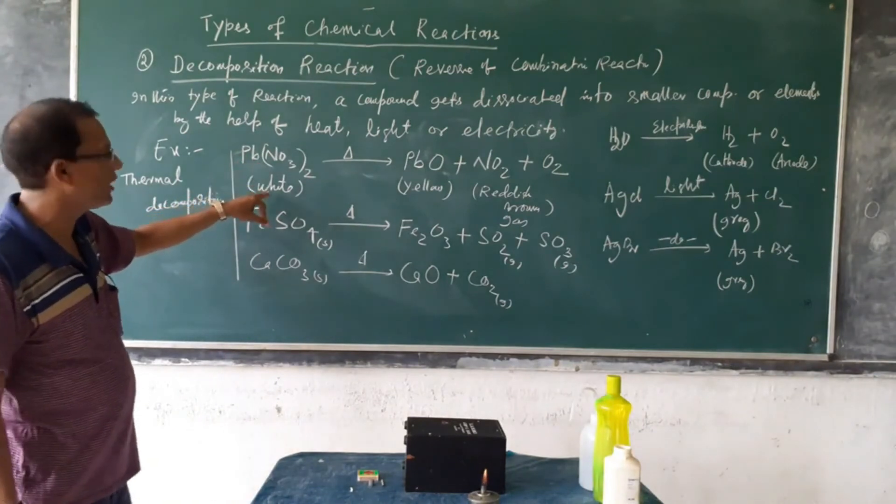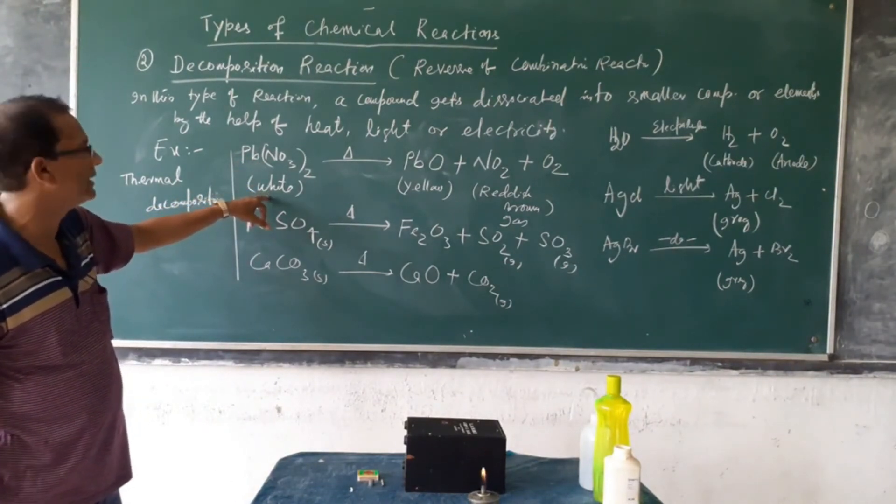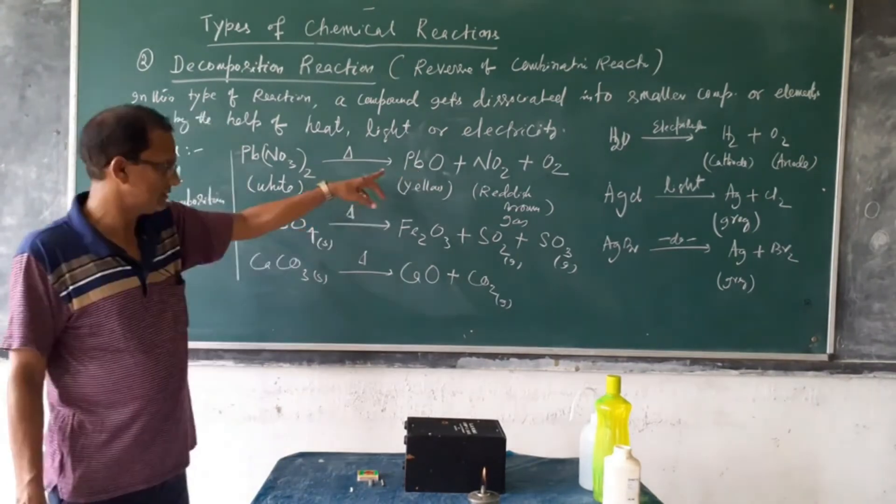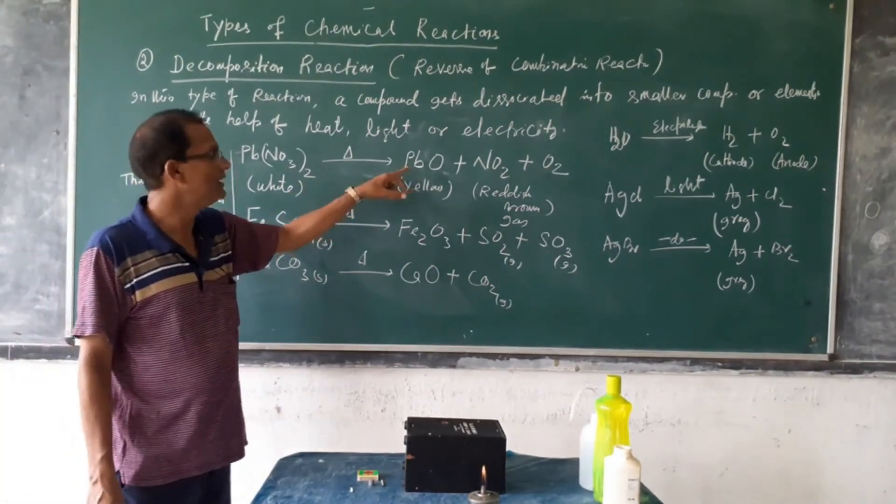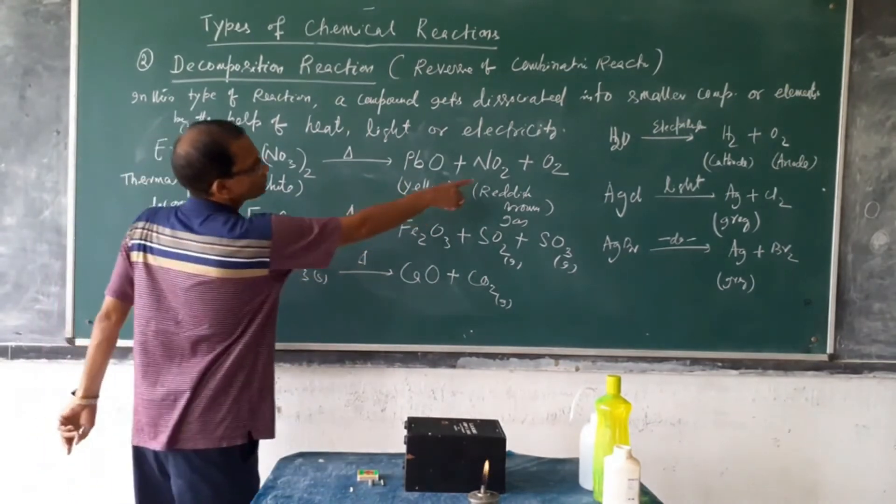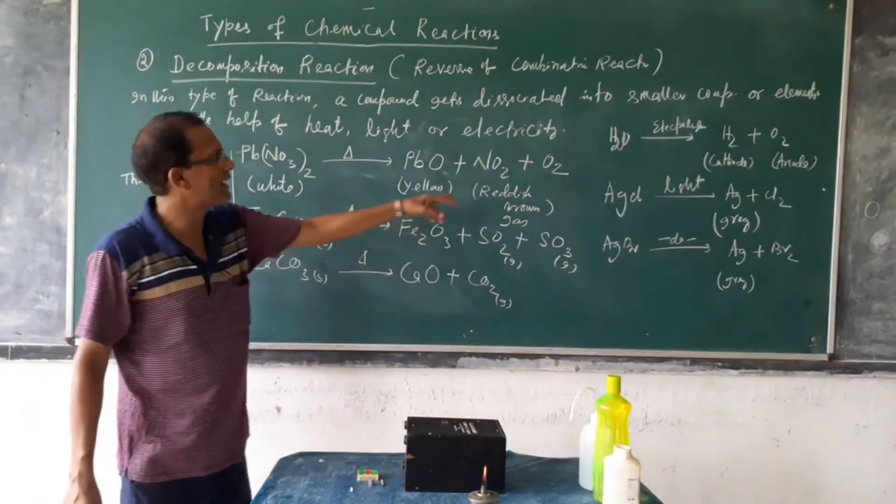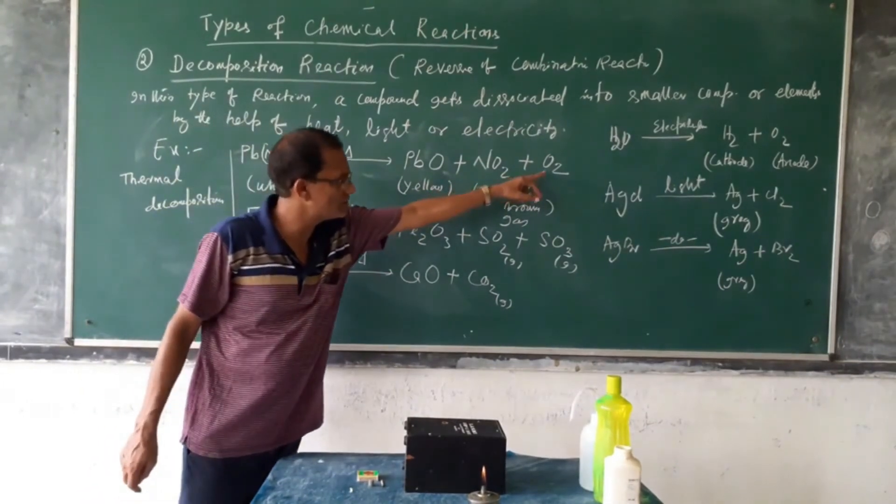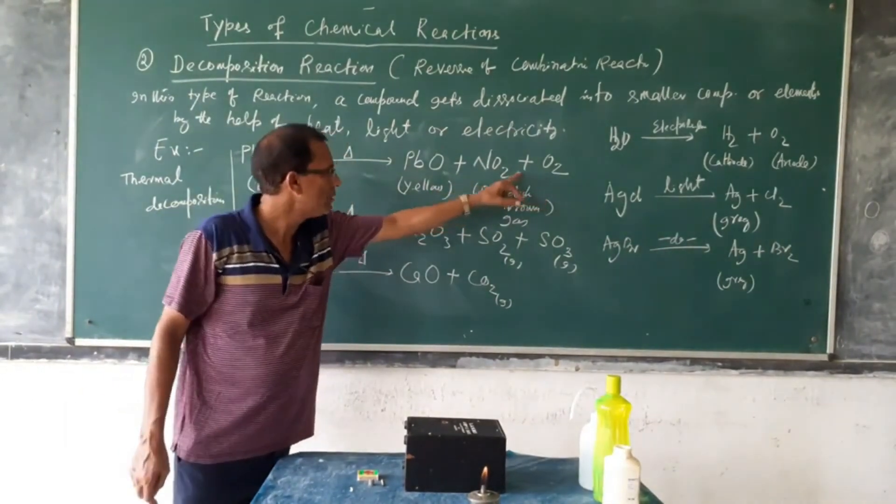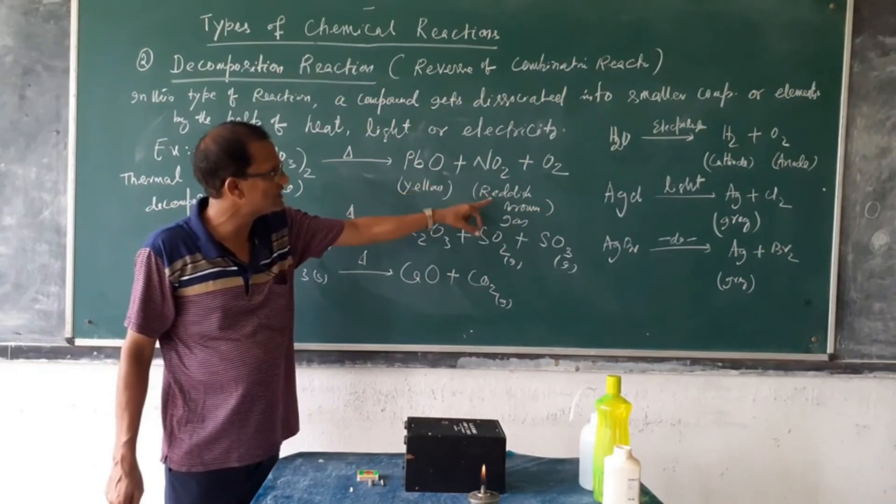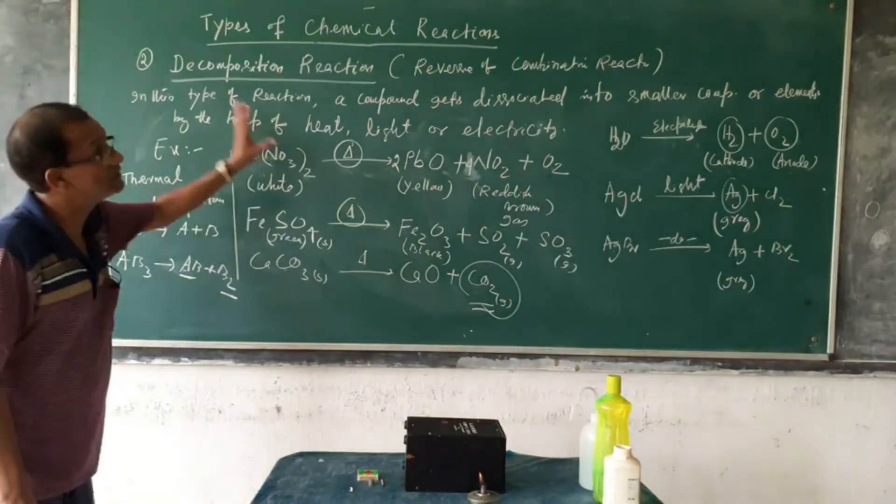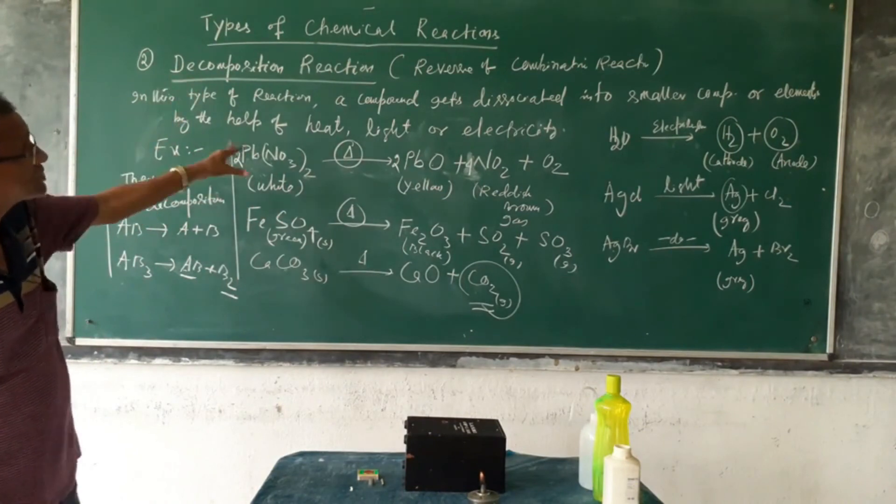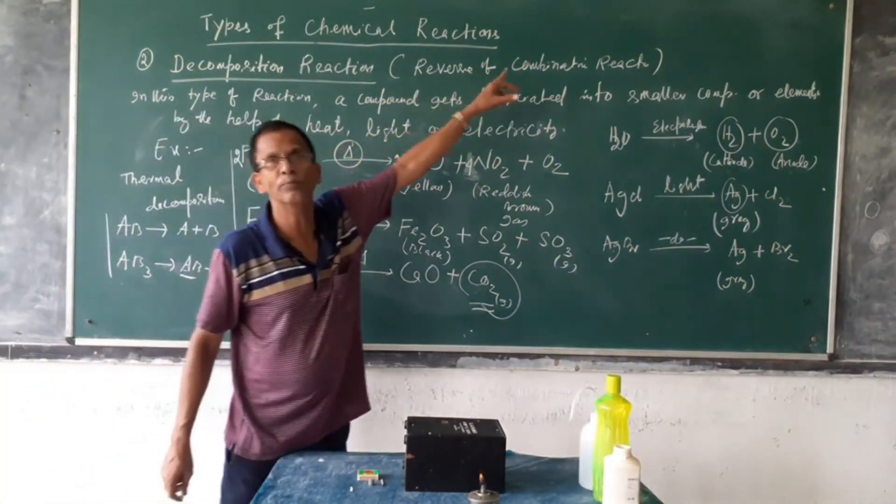Lead nitrate. Color is white. When it will be heated, produces yellow solid lead oxide. That is yellow solid lead oxide and reddish brown gas, NO2 is formed, with the formation of oxygen. Oxygen is not visible but NO2 gas is reddish brown. These are the characteristics of decomposition reaction which is just opposite of combination reaction.